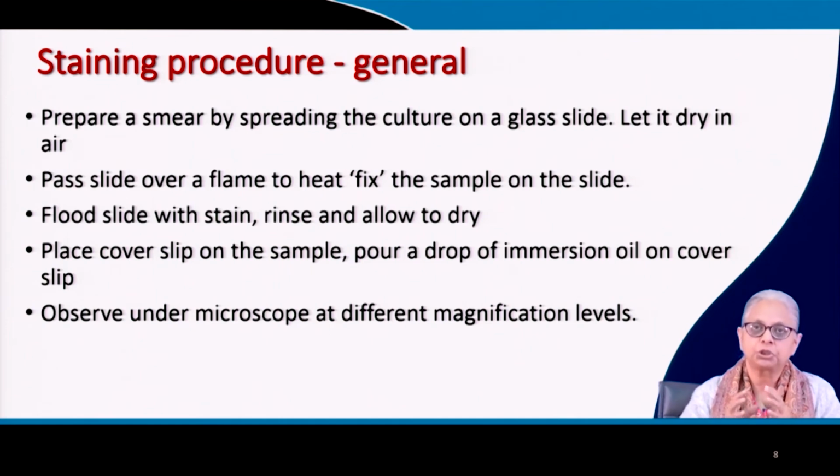And then to ensure that there is no moisture left, you pass it over a candle or a Bunsen burner or some other source of flame, and you apply heat to the sample to fix the sample. So once the moisture has been taken out of the sample, you will get only the solid material that is stuck to the slide.